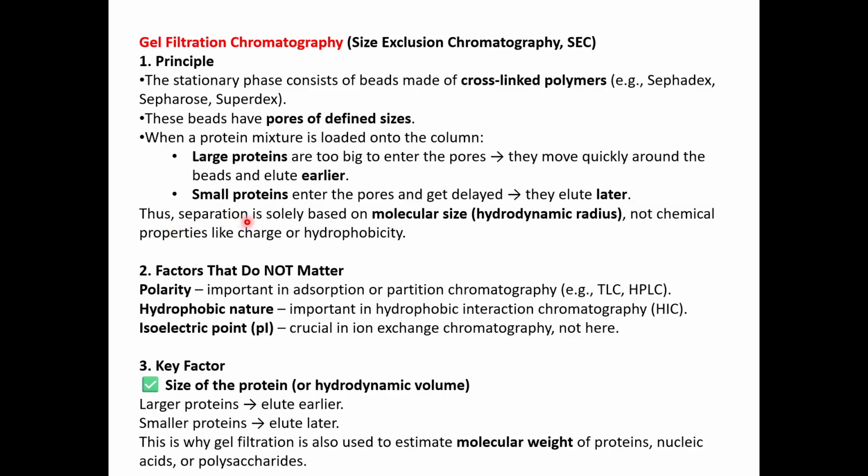Basically, separation is solely based on the molecular size, that is the hydrodynamic radius, and not any chemical property like charge or hydrophobicity. It is only because of the size difference in your proteins, whether it's your native form, different proteins, or unfolded, linear proteins, anything will get separated based on its size and shape.